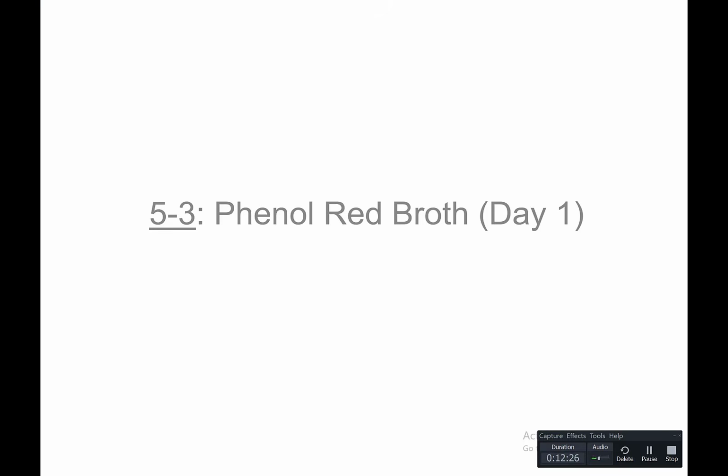So now we're moving on to Lab Module 2. And Lab Module 2 is dealing with our biochemical tests. So one of the things that you're really going to see throughout this part is that you are going to need to study those biochemical sheets. And those biochemical sheets are something we're going to review, but basically you need to know the substrates, the enzymes, the products, if a pH indicator is used, if a reagent is used, what does a positive test look like, what does a negative test look like, etc.